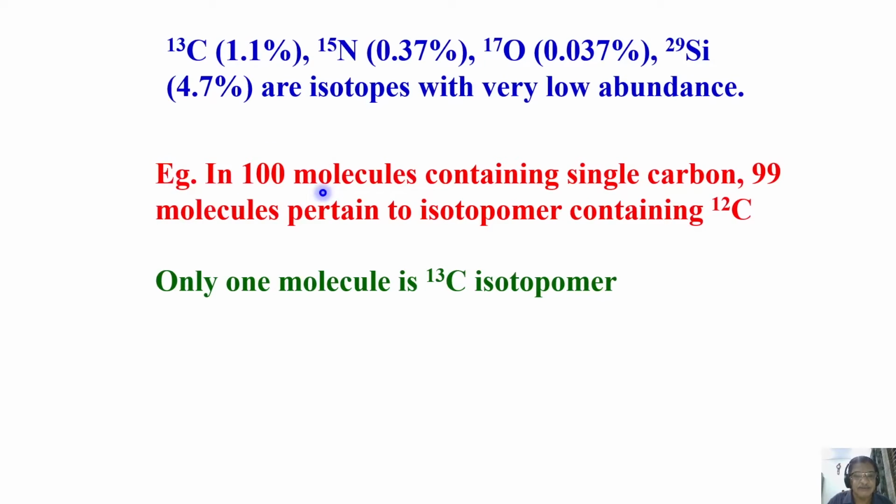In a realistic situation, we take a sample in the NMR tube, which I will show you later. About 3 to 4 centimeter length we take in a 5 millimeter inner diameter tube. You can calculate the volume. Then you can calculate the number of molecules present using Avogadro number.